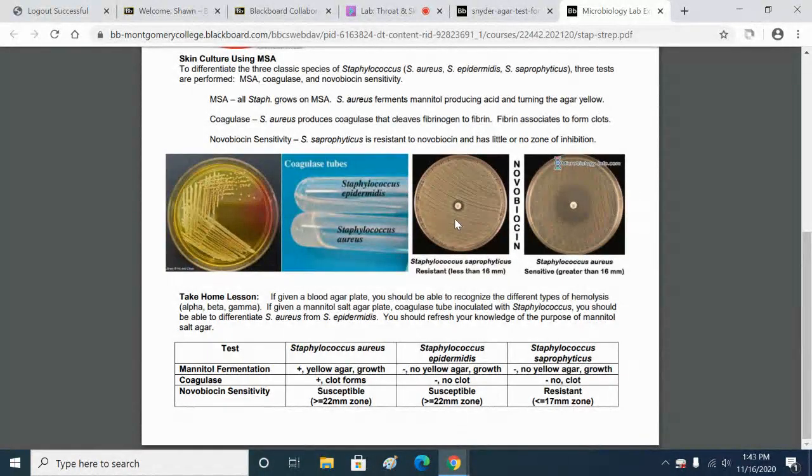In fact, if you look up different bacteria and their biochemical test results, it's very common to see something like, well, maybe 83% of the time that organism is positive for that test. Well, that means 17% of the time it's not. So not all organisms are always positive the way that they should be. Most of the time they are, but there are strains that are not positive. So bacteria do come in different varieties, they have different mutations, and so they don't always match 100%.